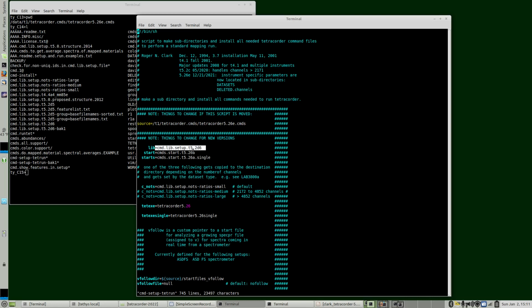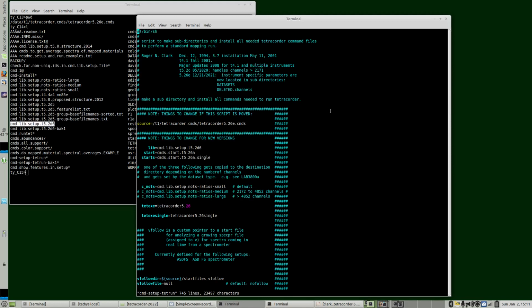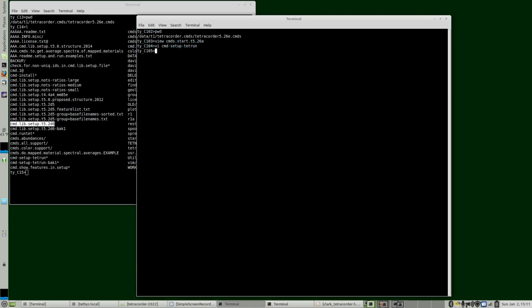And so we're going to edit the library, and you see over here, D6 is the latest. I've made a backup in case I mess this up. Now the strategy here is if we make changes to this file, that means if somebody did another run or the same run on the same data set that they did a week ago, they'd get a different answer.